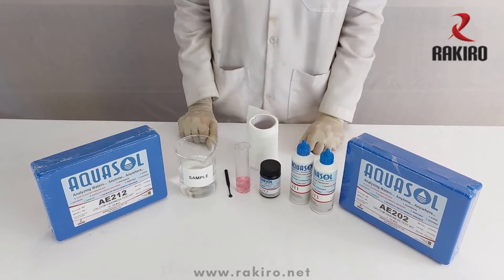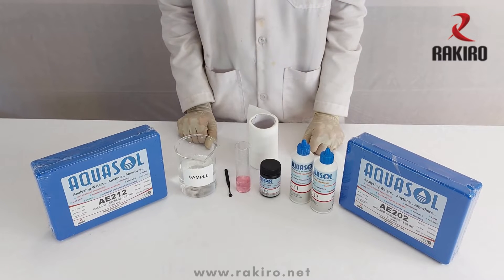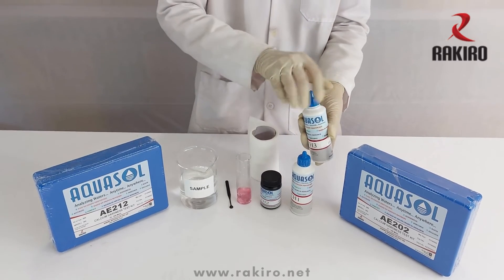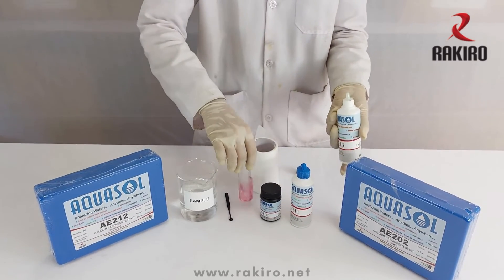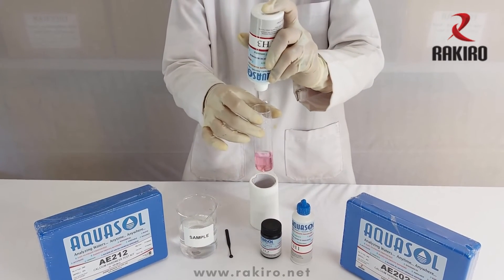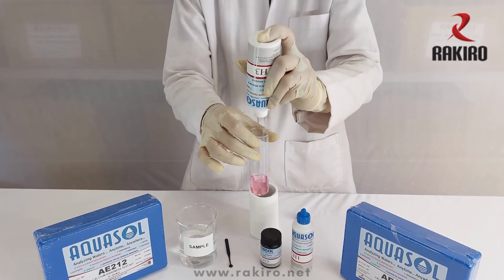To estimate the value of calcium hardness, add reagent CH3 dropwise and count the number of drops while mixing, until the color changes from red to violet.